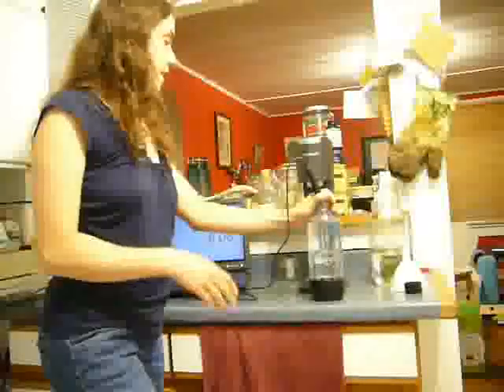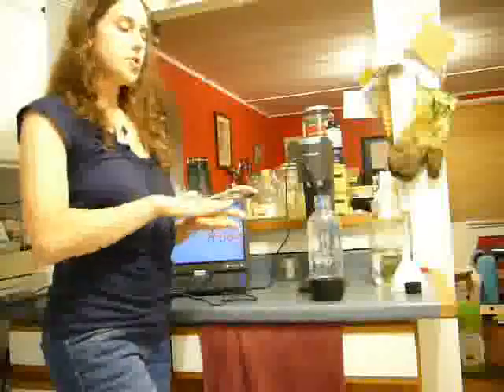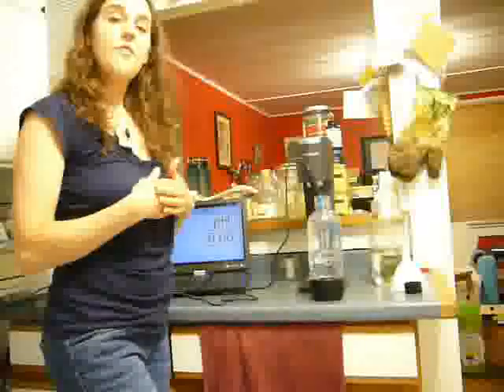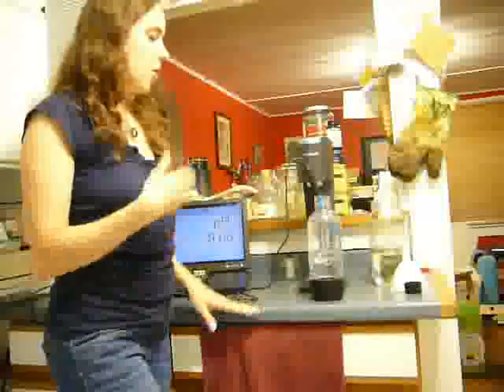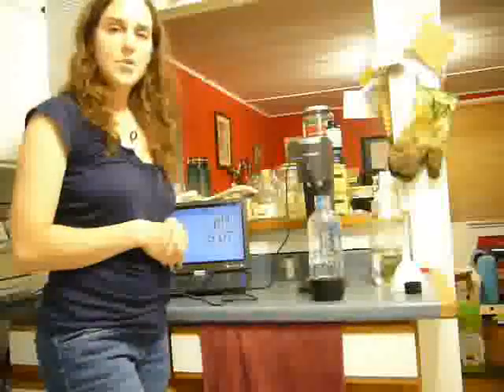So that is a tremendous drop just from the carbon dioxide that we were able to add here. Now obviously this is a very accelerated delivery of carbon dioxide. This is not exactly how it would happen in natural systems, but it allows us to very quickly see how carbon dioxide added or dissolving into water can have a huge effect on the chemistry of that water.